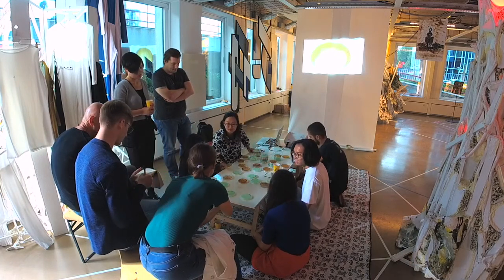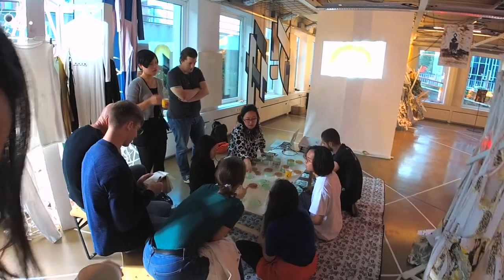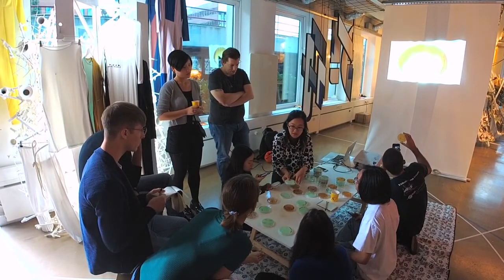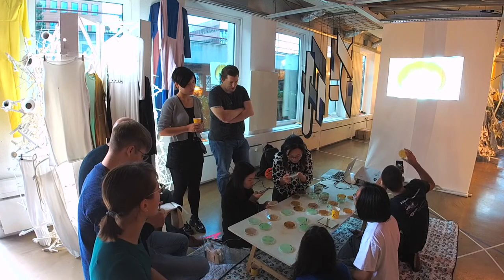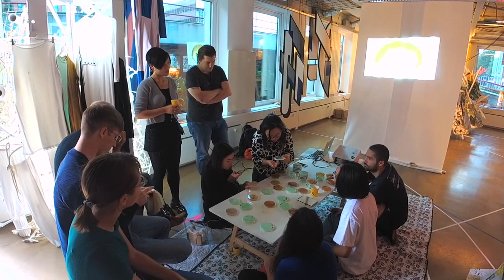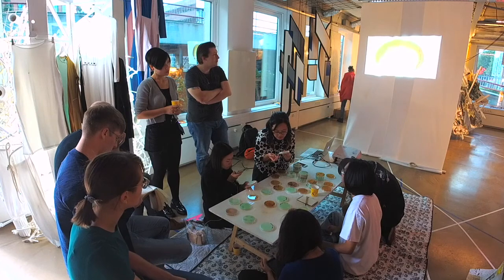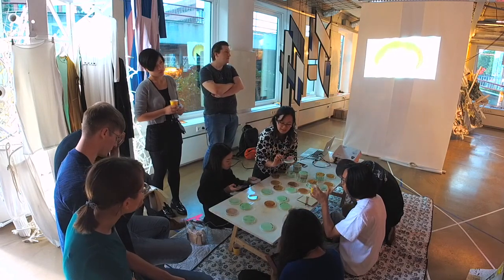But this is probably just a coloration, right? Yeah, I think that's the coloration. But these are more like digested around the edge. Yeah, but the other one, I'm not sure if it has something growing. It's a little bit hard to tell because the milk agar is not that transparent. Yeah, and maybe it's not that ideal to have the milk agar for this one as well.